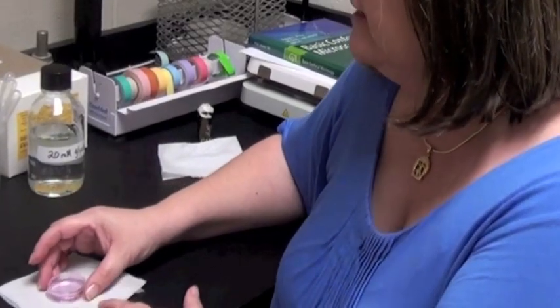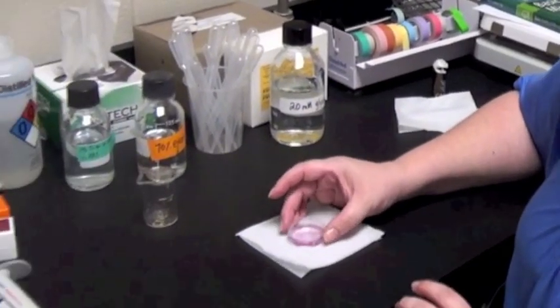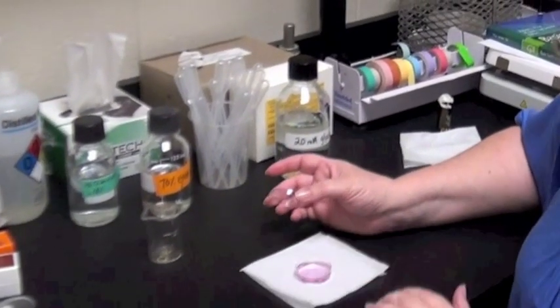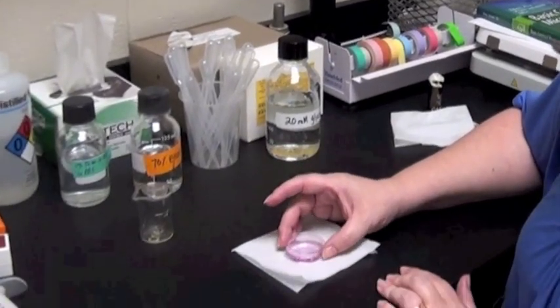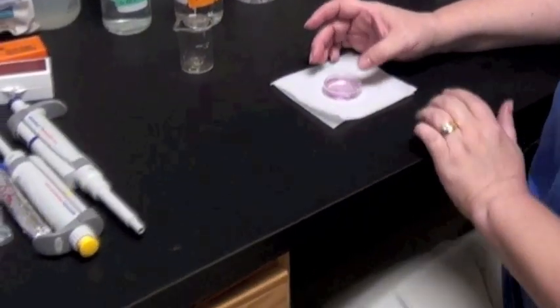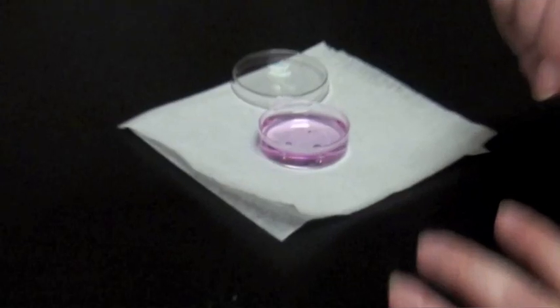One traditional way that you would have your cover slip mounted is with cells on it and you'd have media in your flask. The main thing that you need to understand when you're talking about fixation is the consequence of the fixation on your specimen and what that's going to mean when you start to do microscopy.